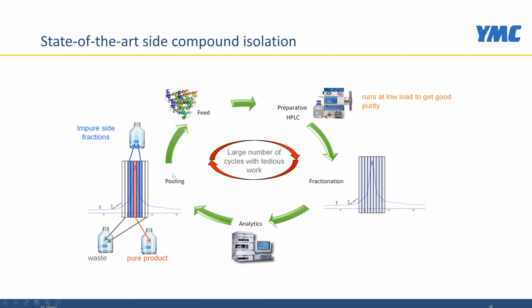So this can take many cycles, and it can take also a couple of days. So we hope then also at the end that what we have produced on day one has still not degraded, let's say oxidized, deamidated, or degraded in some other form, so that we can still mix it and still have representative material compared with runs that have been run at a later stage, and material that has been produced on later days.